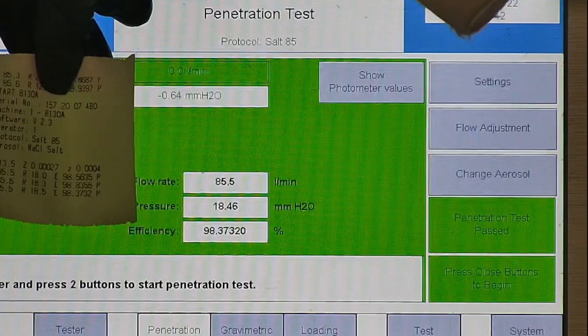R is for resistance, also referred to as pressure drop. This correlates with breathability — so the lower the number, the more comfortable and breathable the mask is. E stands for filtration efficiency percentage. As shown, the filtration percentage for all three samples was 98.37% or higher.